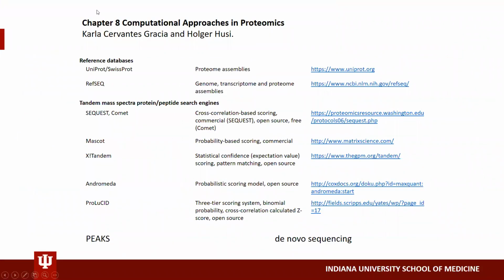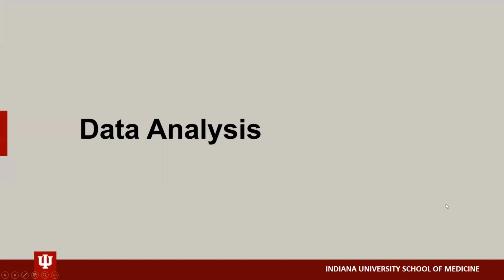Again, just to loop this back around, it's one of several ways of visualizing results from the different tandem mass spectra protein peptide search engines. Scaffold really will let you take any search engine results and load them. It will allow you to apply FDR cutoffs while it's loading the data, or you can now do an X!Tandem search that's actually integrated in the Scaffold software. But again, this is only if you're creating your own Scaffold file. And it will help with your data analysis.